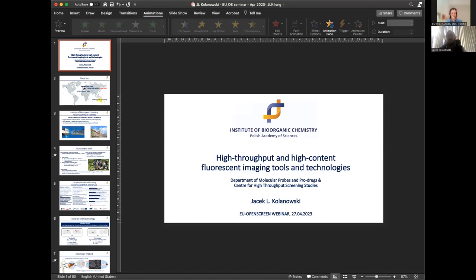Another one, which is more a general one: what are the limitations of bioluminescent systems? I see that many of you are interested in the bioluminescent systems. I have focused today on the fluorescent for the particular reason that fluorescence allows you this unprecedented resolution which cannot be attained by bioluminescence. And I think for molecular imaging, if we talk about the spatial information about the distribution of the target, bioluminescence is not the best tool to look at.